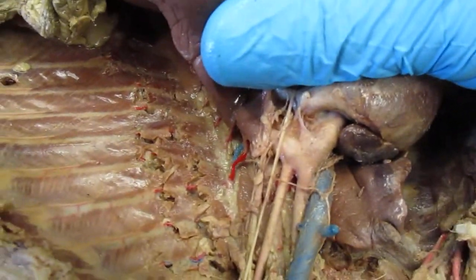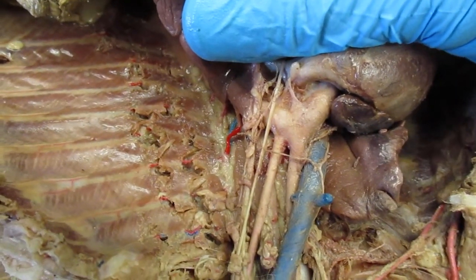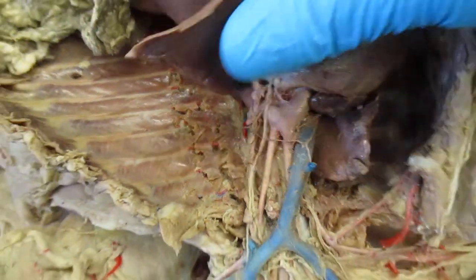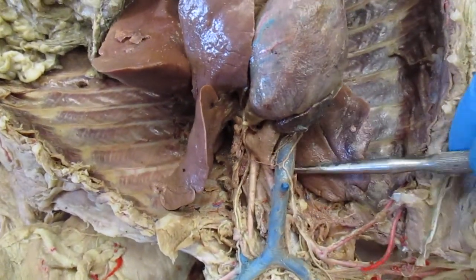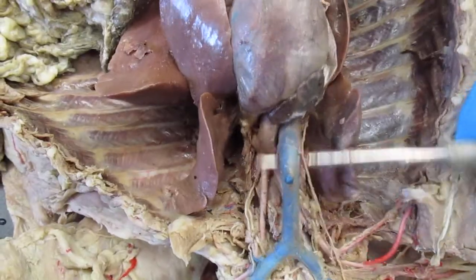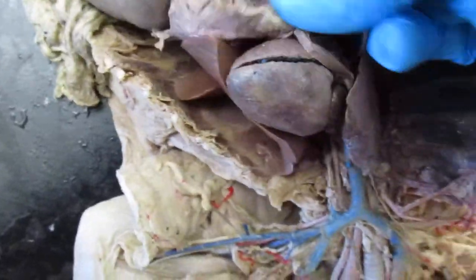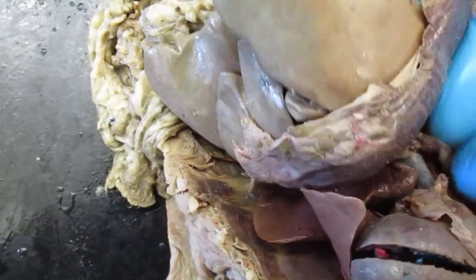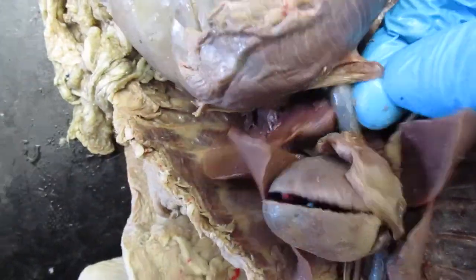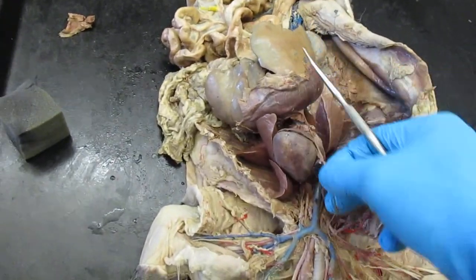That is the aortic arch. Okay, this blue structure, what is it? Oh, excuse me. This is your superior vena cava, and then this structure here is your inferior vena cava. Let me move some of this stuff out of the way. Inferior vena cava. This right here is a vagus nerve right here.